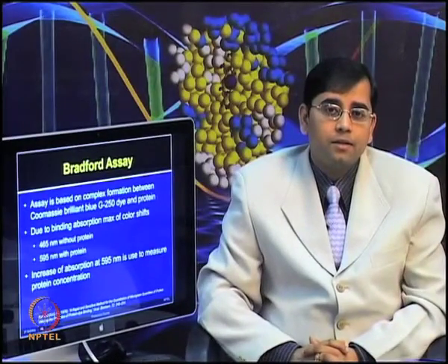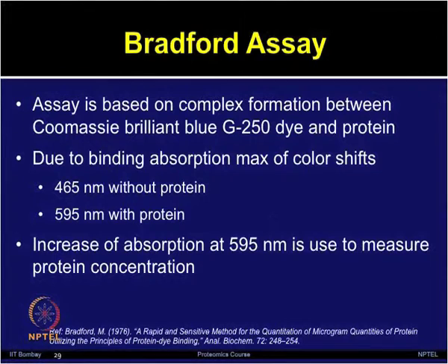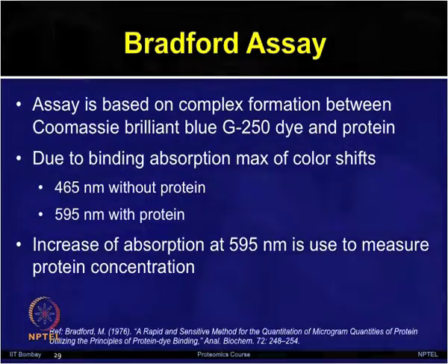Bradford assay. This assay is based on the complex formation between the Coomassie dye G250 and protein. Due to the binding, the absorption maximum shifts from 465 nanometers to 595 nanometers. This increase of absorption at 595 nanometers is used to measure the protein concentration.